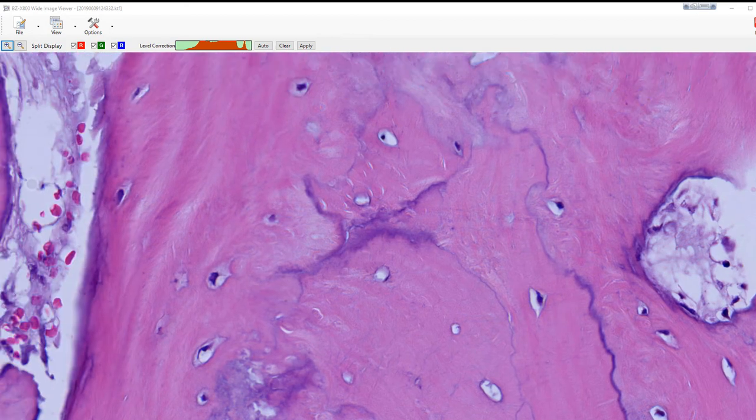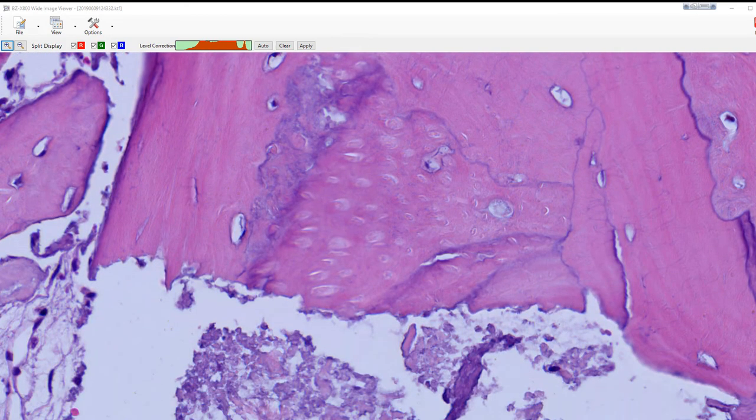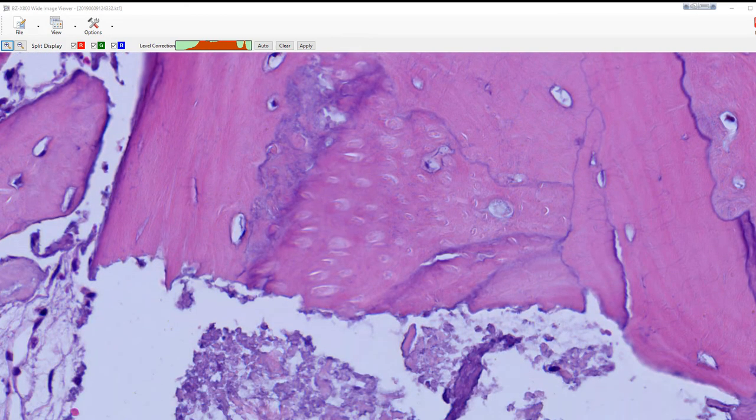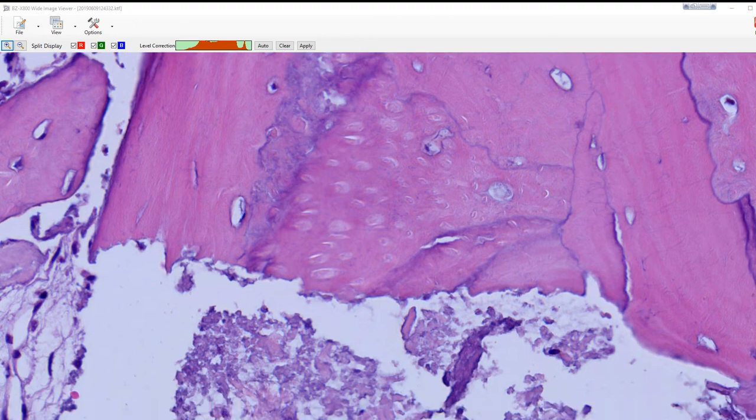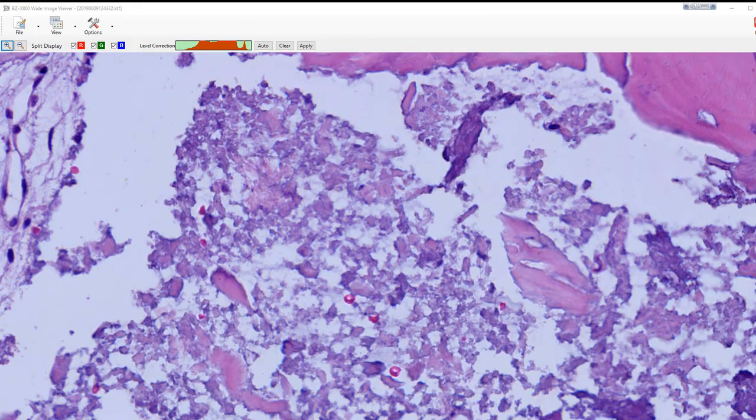If you look at this, you can almost see where the resorption is taking place.